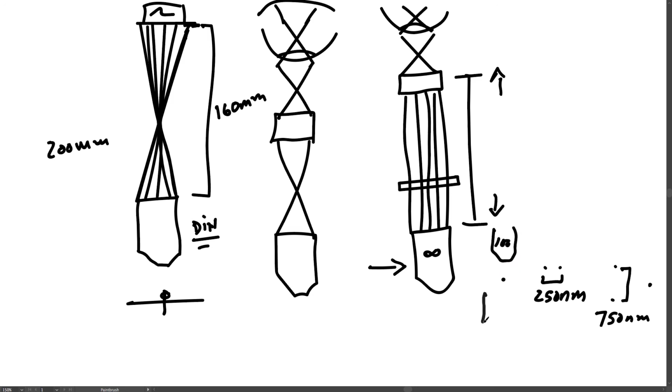And if you use a 200x objective lens, you'd see a dot, but it would just simply be twice as large because it's twice the magnification as the one imaged with the 100x objective. So because of that limit, they don't make objectives that are higher than 100x objectives.